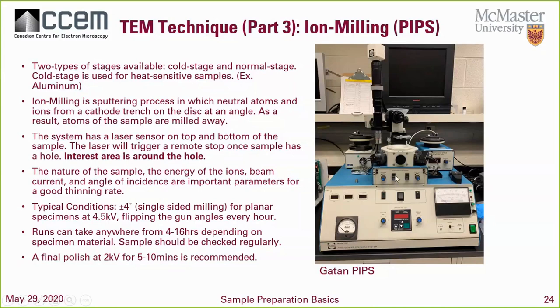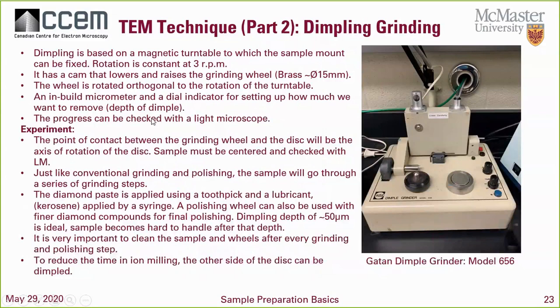And after an hour at 4.5 kV, I would flip the guns, and on that hour, I will come and check it to make sure that the removal rate is good, that I haven't already made a huge hole. Because sometimes in the dimple process, it's hard to keep track of a measurement. How deep did you go? Because micrometers tend to be a little sensitive, especially ones like these CAM micrometers.